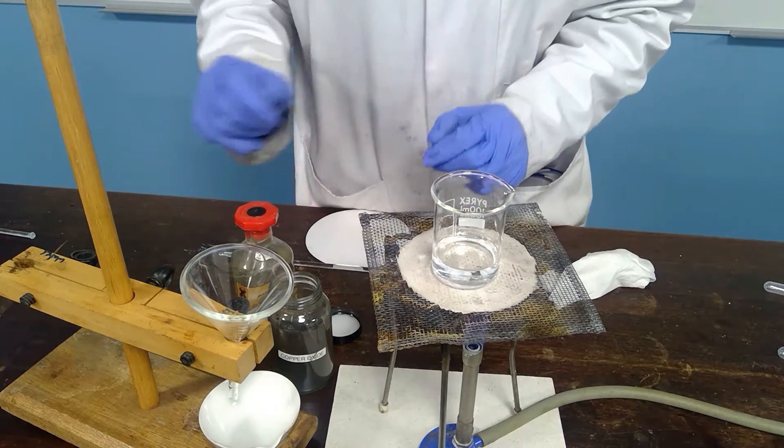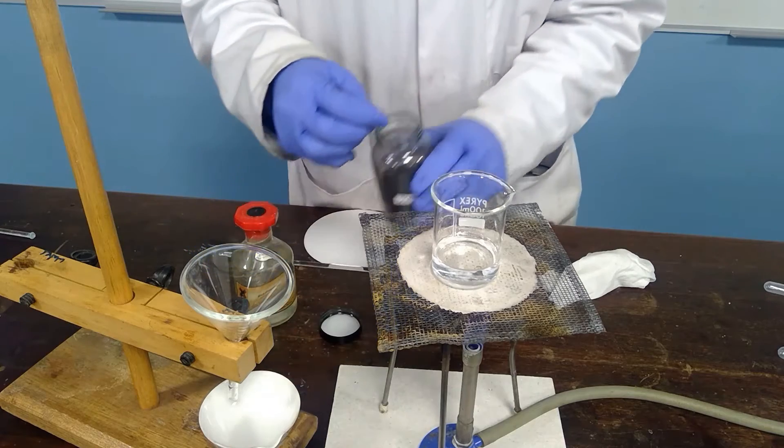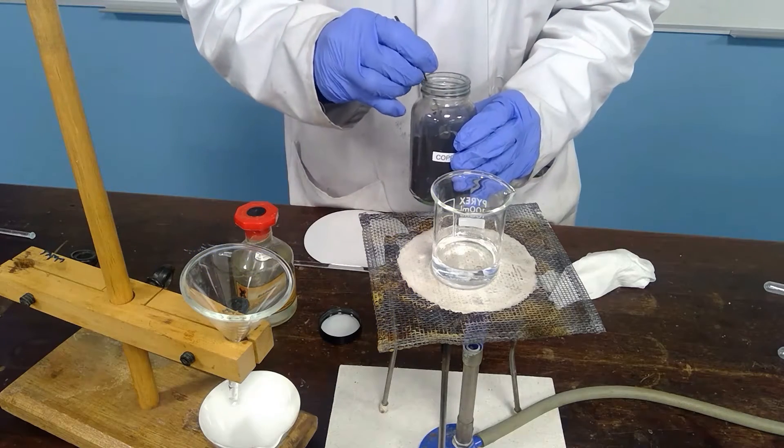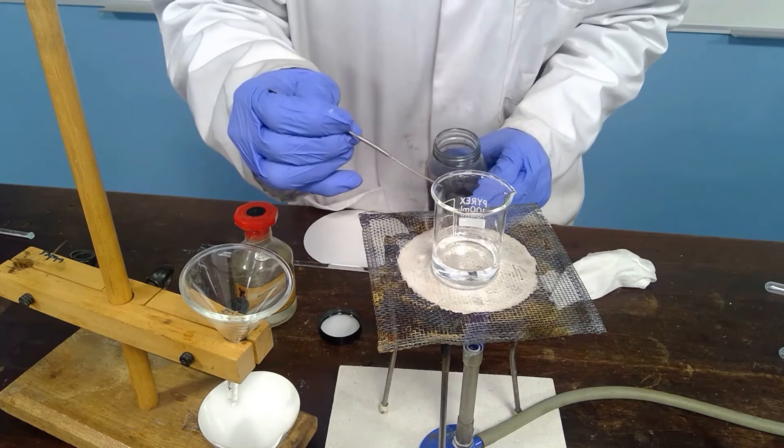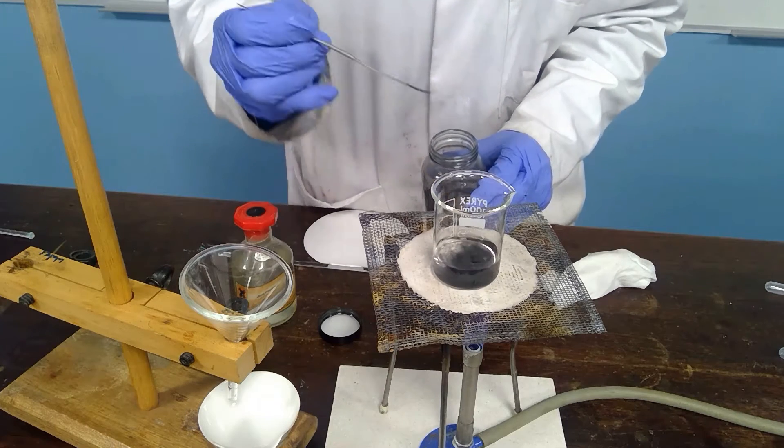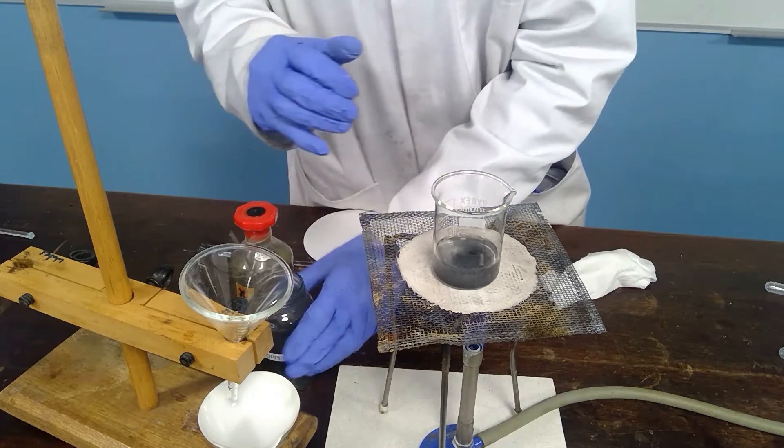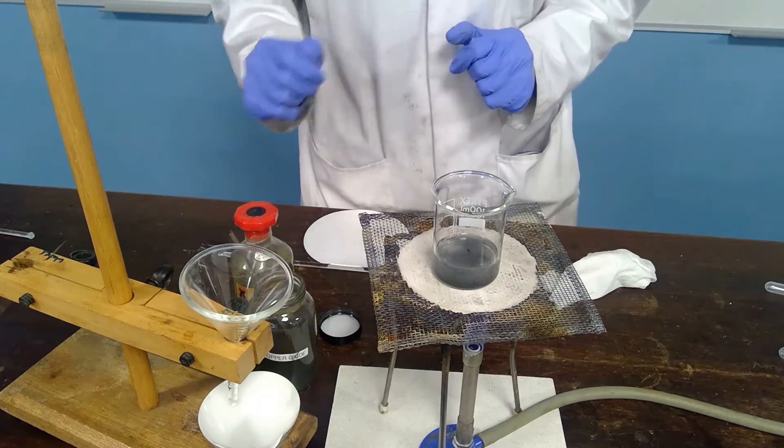Once the acid has warmed a little we will add some of the copper oxide to the acid. The copper oxide will neutralize the acid and make copper sulfate and water but while it is relatively cold this reaction will be slow.